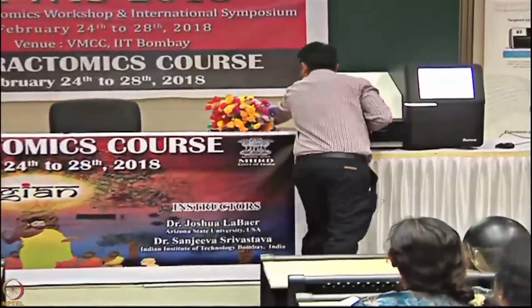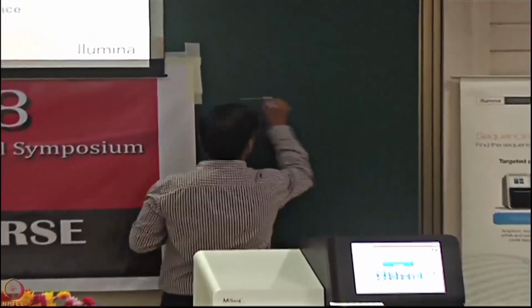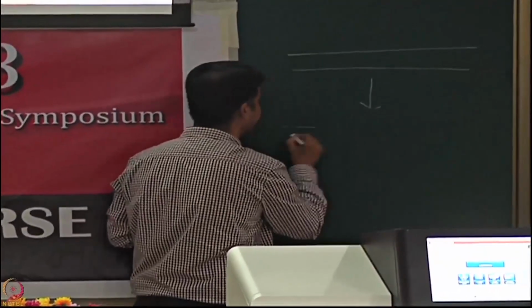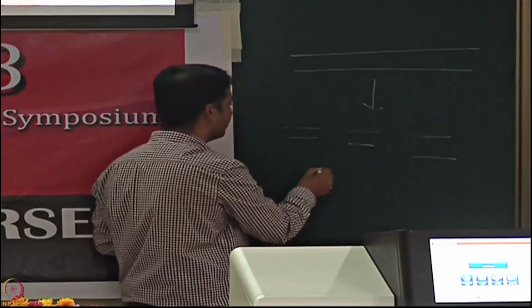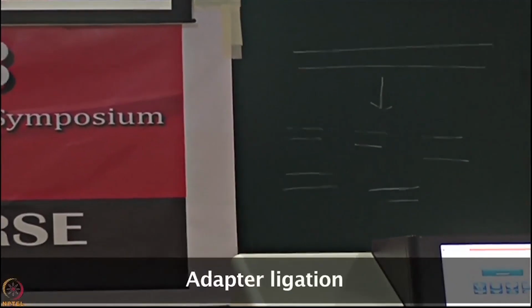Again, the same question I'm asking. Let's say there is a human genome. In Sanger, for any genome, human genome, big genes, initially the first step is we fragment it into various small fragments. Let's say for the human genome, 600 base pair, we'll chop it down into millions of fragments. But these are unknown. So to get them sequenced, what do we need?